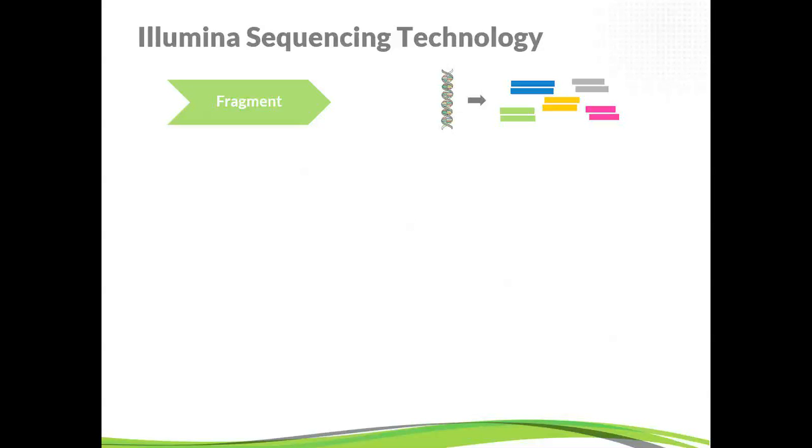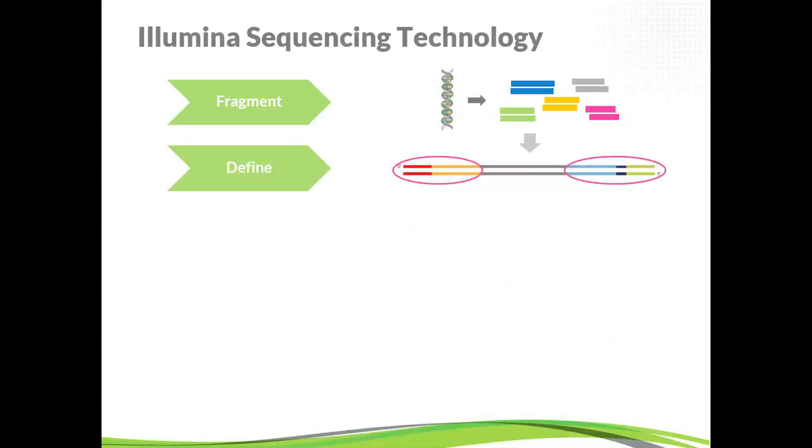There are different ways of achieving that, which we'll discuss in a lot more detail. Essentially, there are enzymatic ways of fragmenting, and there are mechanical ways of fragmenting. As I say, we'll go into that in more detail later on. The whole idea of fragmentation is to break the DNA that we're interested in into random pieces, completely random pieces. Remember, we're trying to get unique overlapping sequences, and so fragmentation has to be entirely random.